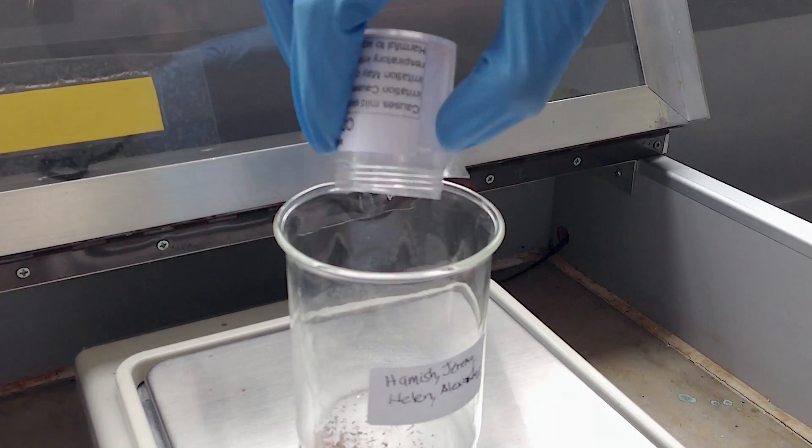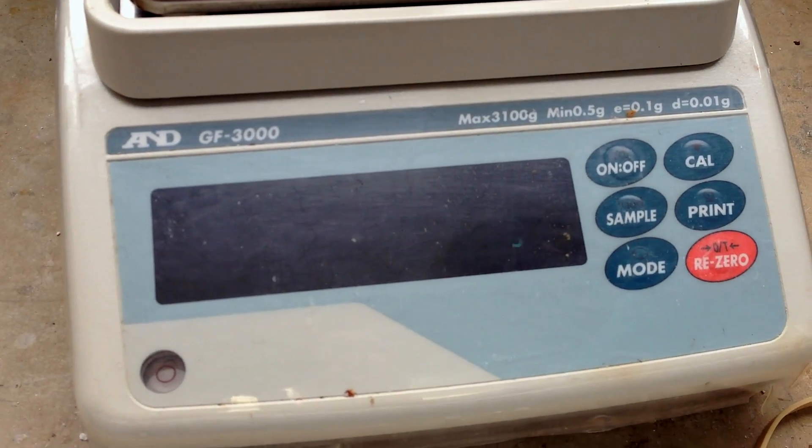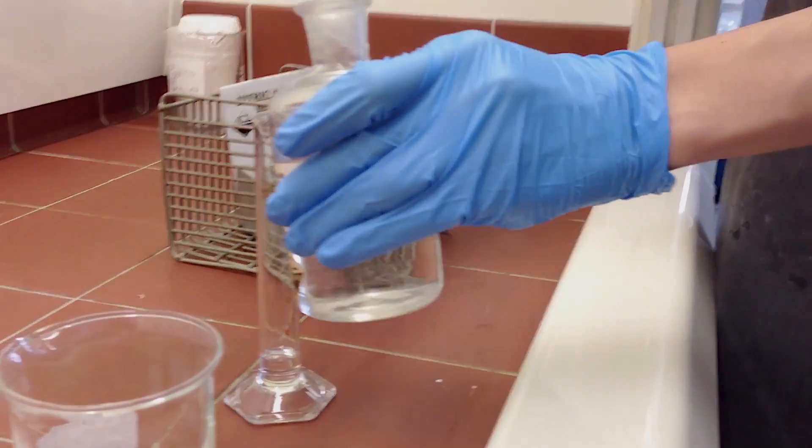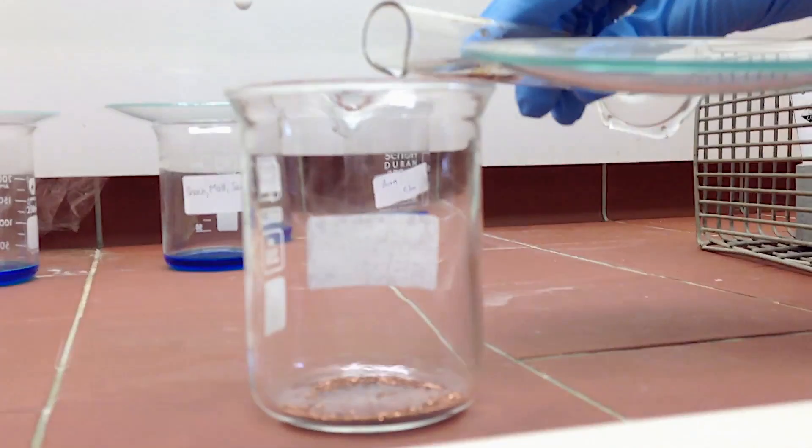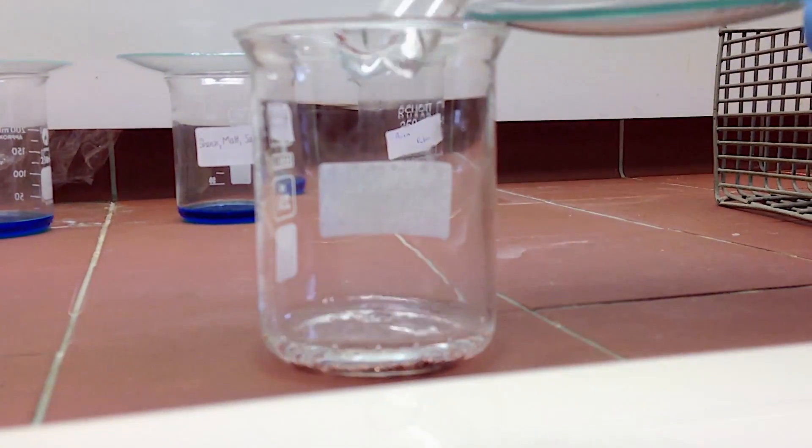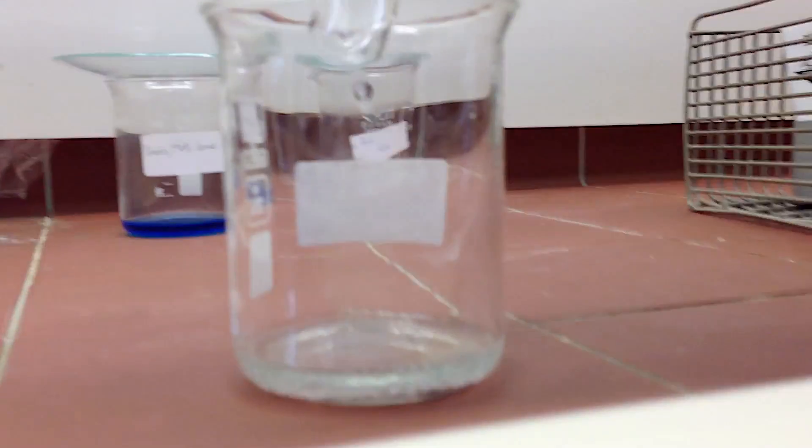We began by weighing roughly 1.5 grams of copper turnings and then added 15 mL of 8 molar nitric acid. Since this created noxious gas, we left it in the fume hood to continue reacting overnight.